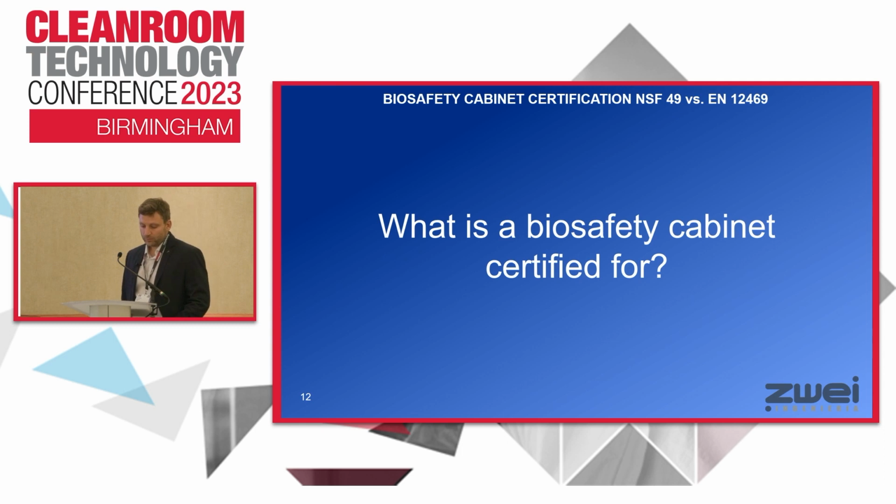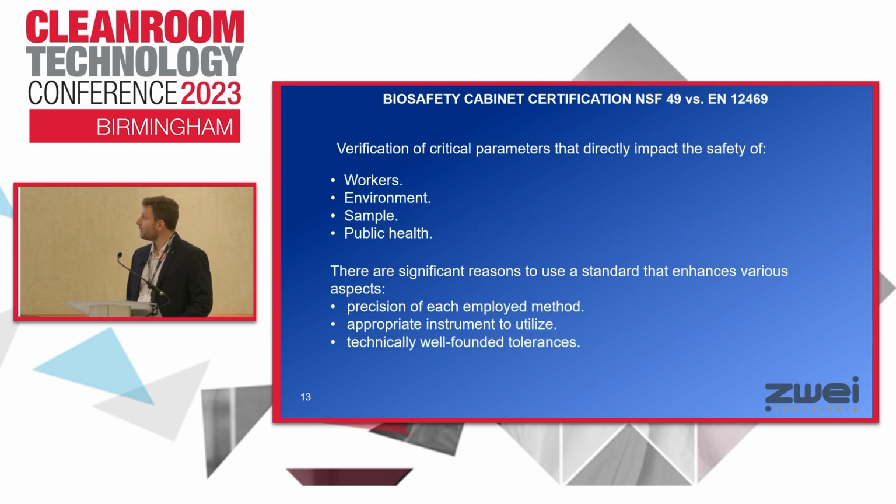What do we test on biosafety cabinets? We do a test to verify that the critical parameters that impact directly on the workers, environment, samples, and public health comply with the manufacturer's instructions, because they demonstrate through rigorous microbiological testing that in this condition of permanent flow, the biosafety cabinet is protecting workers, environment, and samples.